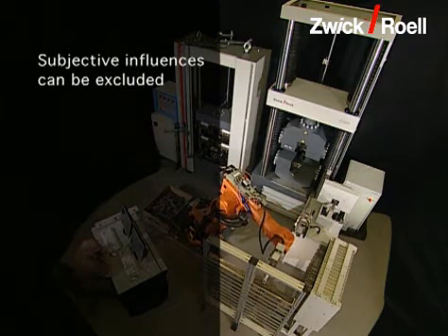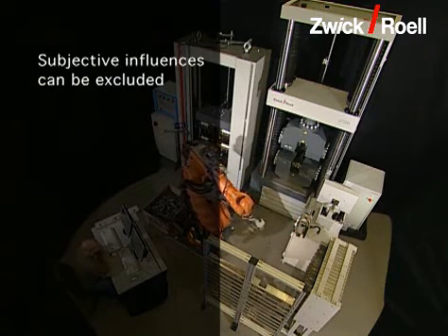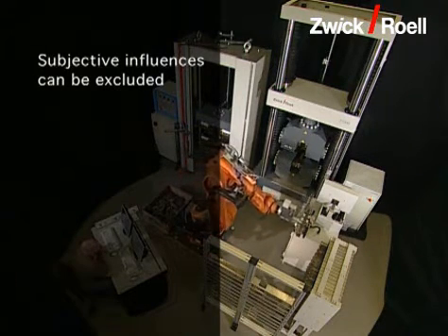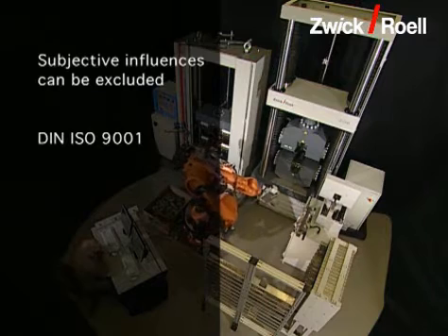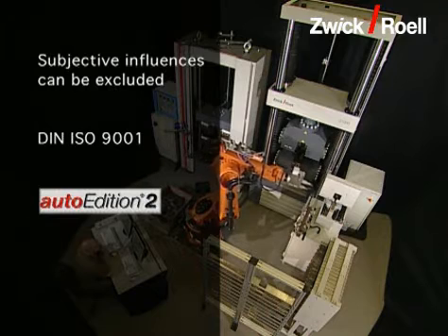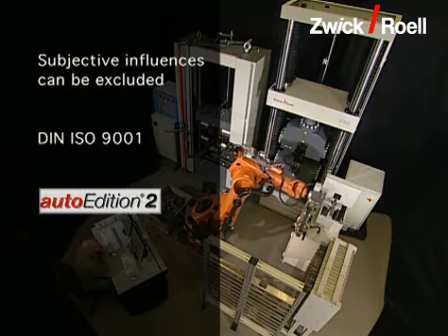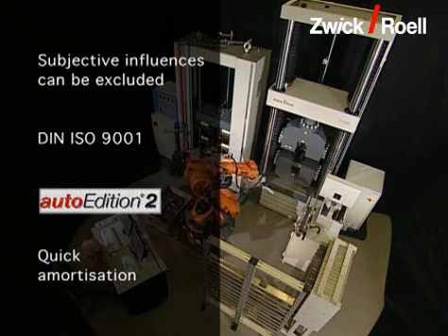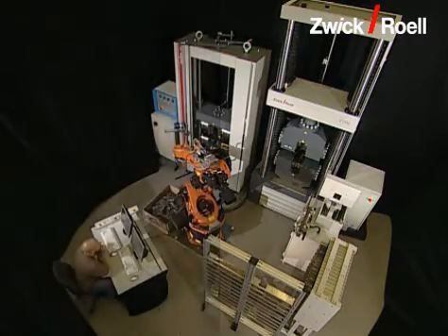Due to the high positioning accuracy of the automatic testing system, subjective influences are excluded. In the case of manual tests, these can have a negative influence on the quality of the test results — for example, because of different users. The traceability of the testing conditions according to DIN ISO 9001 is guaranteed. With the ZWIC software Auto Edition 2, an automation module is used which meets the most modern technical requirements. Due to the low test costs per specimen, a testing unit with automatic specimen feed pays for itself within a period of about two years.